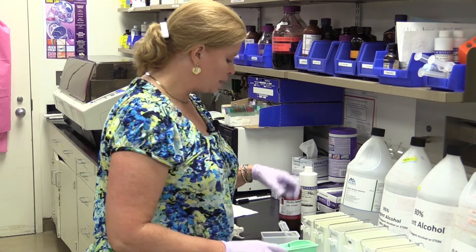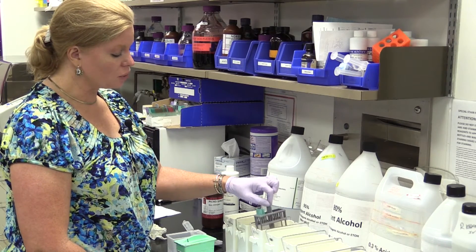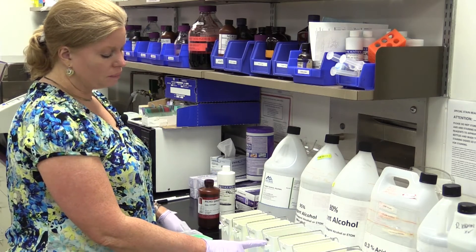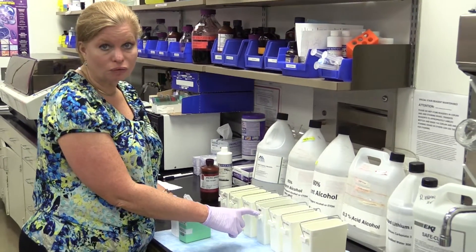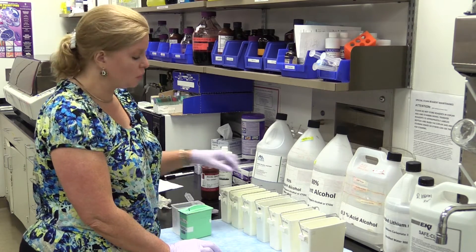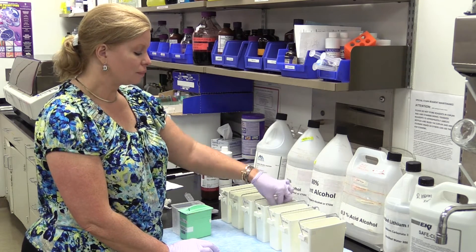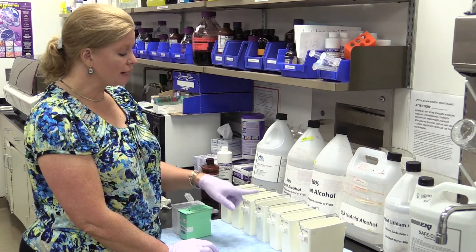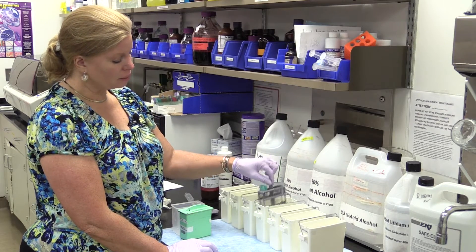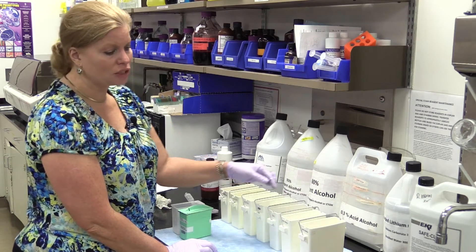My five minutes is up in the last xylene. Now I'm moving on to the 100% alcohols. Some laboratories believe you need to hold it in there for a full minute or two to get the xylene off — I disagree with that. We seem just fine putting it in there for about 10 to 20 seconds with agitation. The purpose of this 100% is to get the xylene substitute off. We go into the next 100% to make sure it's really off and start into our dehydration process.